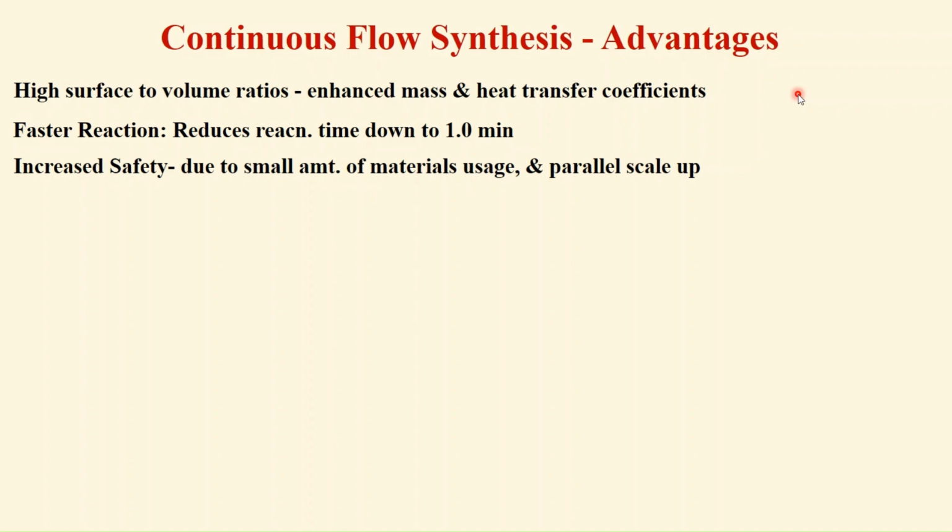In this, we are producing these azides in very small quantities, and as soon as it is produced, it is utilized, and in this way it increases the safety.